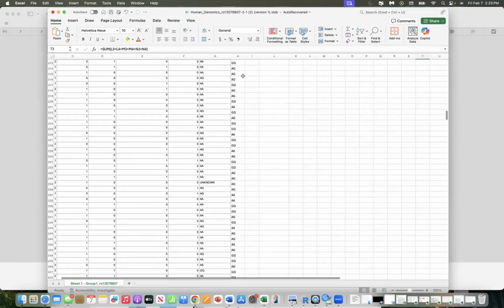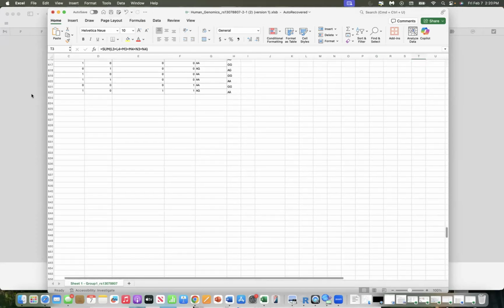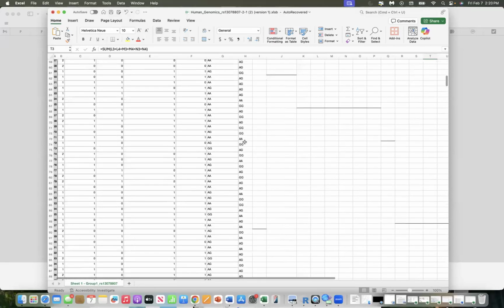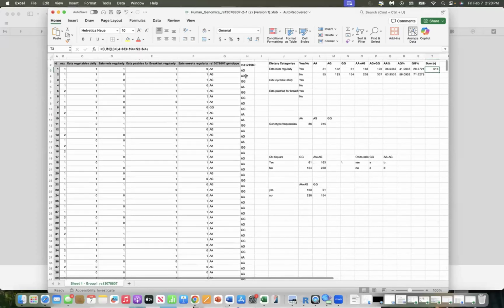I just want to point out, if you were to scroll down here, we have 620, we go to 622. Well, don't tell me there's 622, because as you see, when you scroll through, some of them were no calls. That was just not a good read there. And so those numbers from my column to your column won't even be the same. And from each question to the next, it could be slightly different if there's any missing data. So I want you to have that because that's going to be a good number to use to track and make sure some of your other calculations are being done right. And I'll show you how you would be able to determine that.